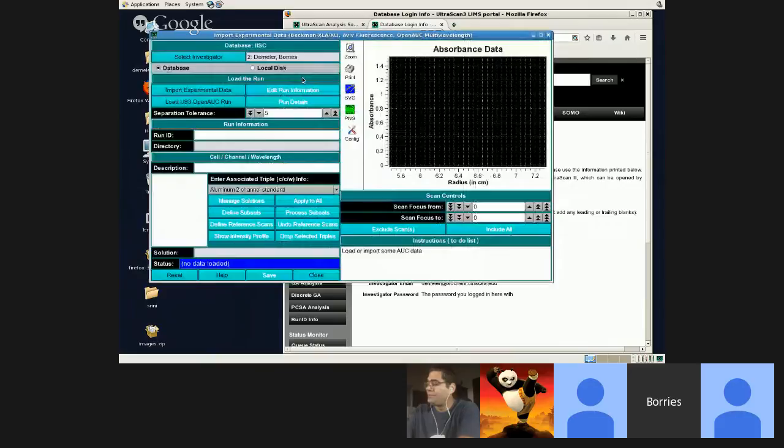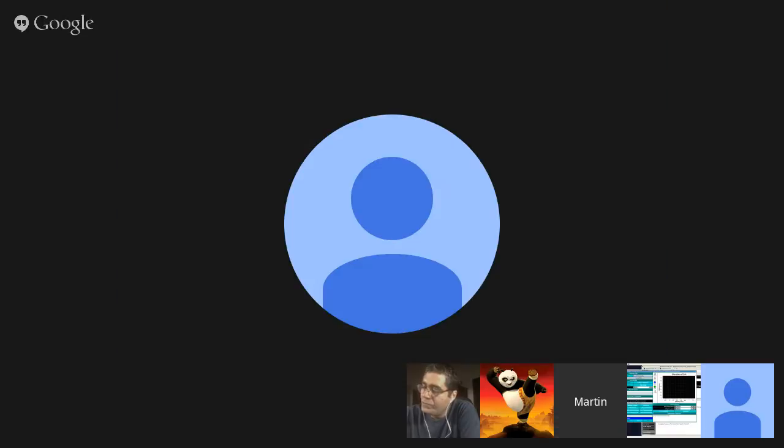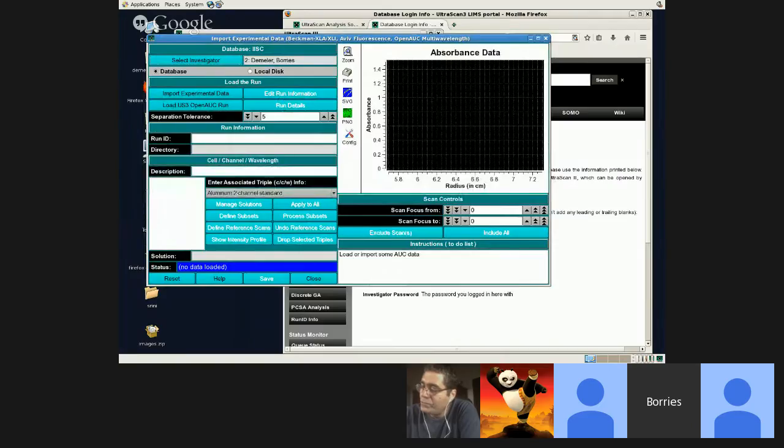This is a place where, number one, we upload your experiments into the database, and number two, we connect all of the details that go along with your data to the data in the relational database. So when we analyze it, we know where to find all the pertinent information that's required in order to make the correct calculations and so forth.